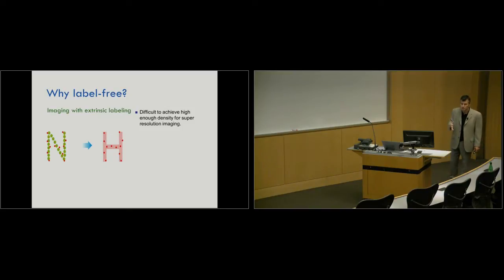of DNA, and intercalating agents do that. Well, they kill the cells at the same time. So the problem is, especially for very high resolution, you can't do it non-invasively with labels. You're going to perturb the cell function. And if you image that, the question is, which processes are you really imaging? Okay, that's one issue: the label density.